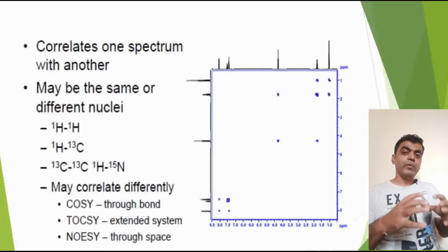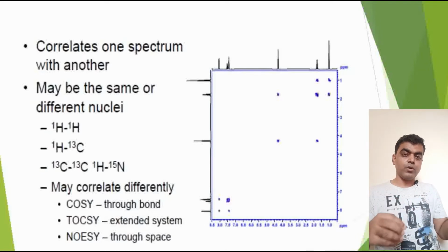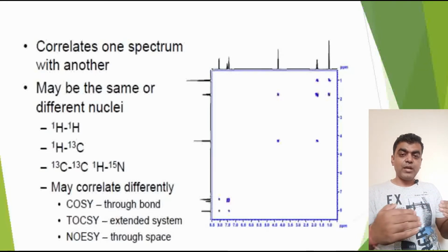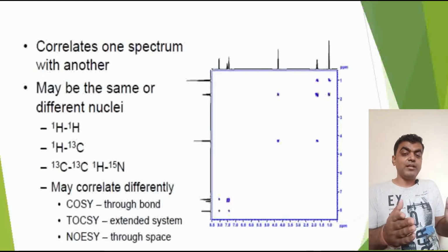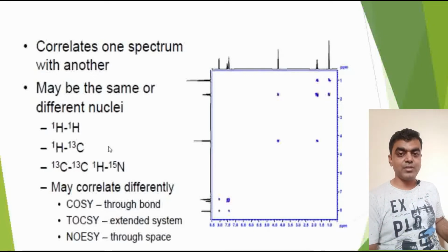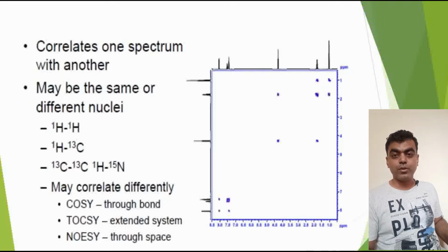Secondly, when a structure is there, you have a carbon backbone and you have protons on it. You can have functional groups, you can have oxygen, nitrogen. So what is important is, if you can find out the basic backbone and correlate with the neighboring protons, then 90% of the structural elucidation is done at this point. So we can do not only proton correlations, we can do proton carbon correlations, and proton carbon correlations have much more information compared to a proton, right?